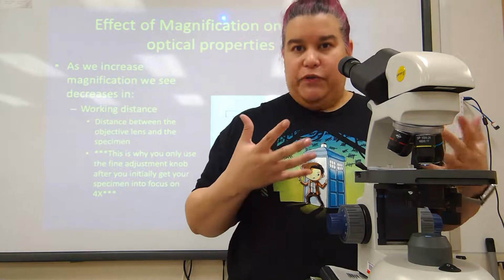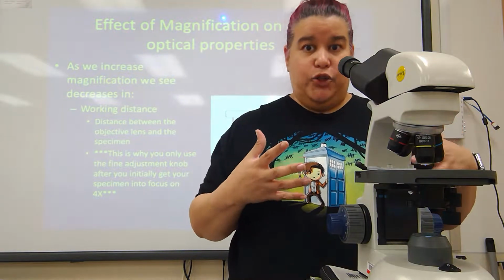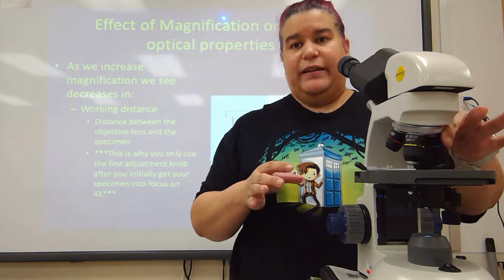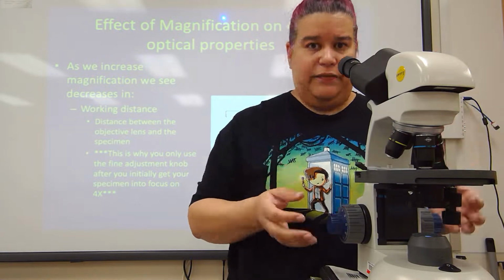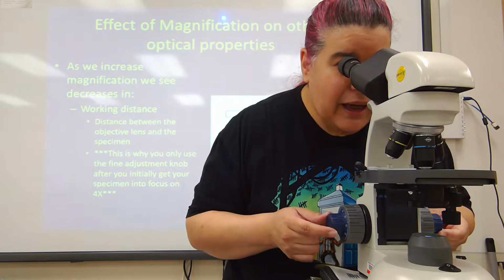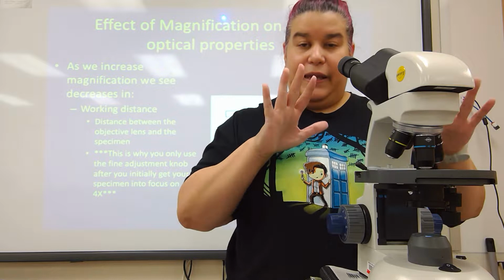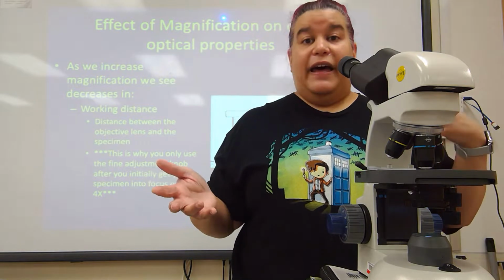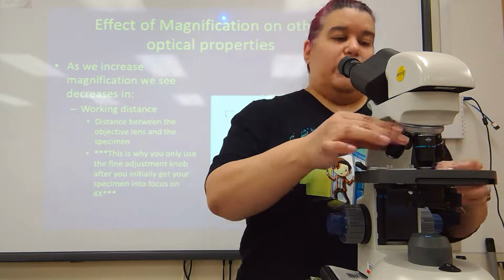I don't need to move it very much for it to be in focus. If I move to 40x, the next objective higher, again, only fine focus. I can move it just a little bit and it'll come back into focus. I don't have to start all over from scratch. That's parfocal.